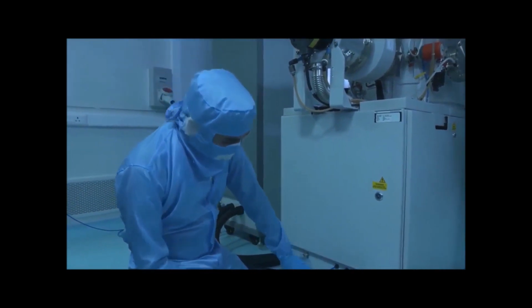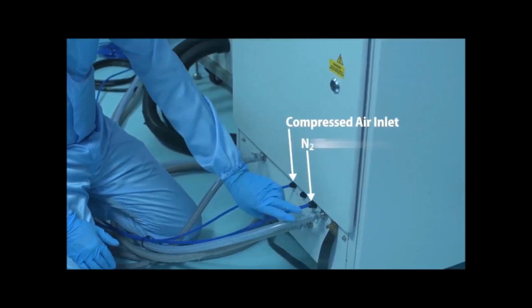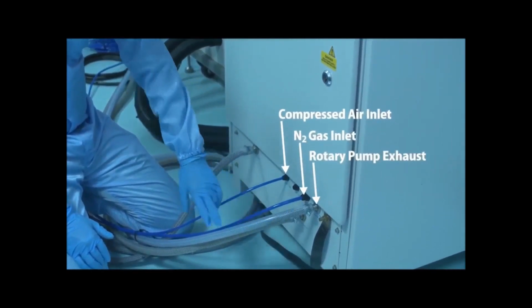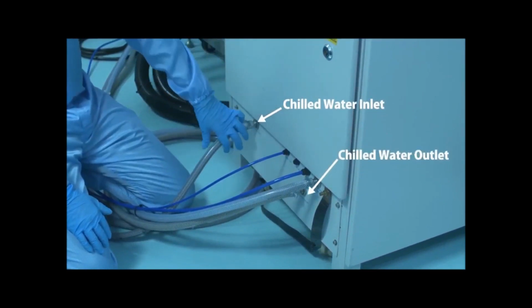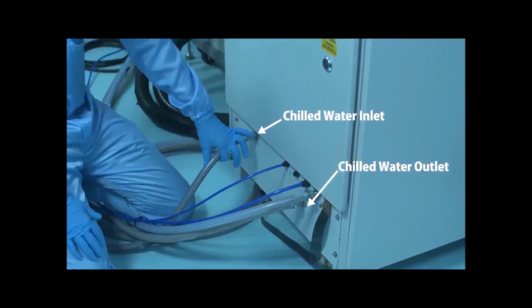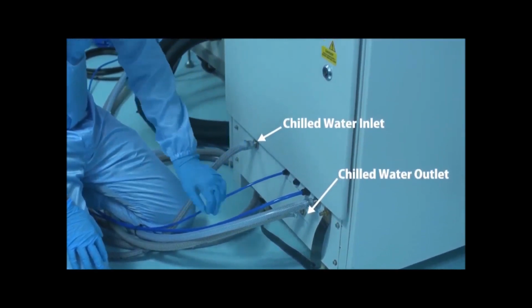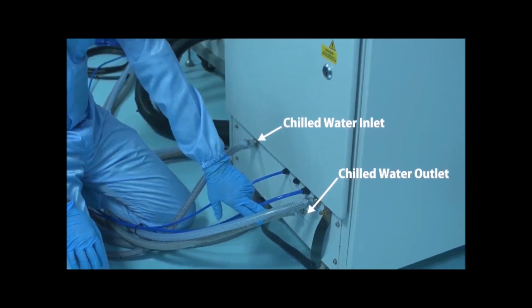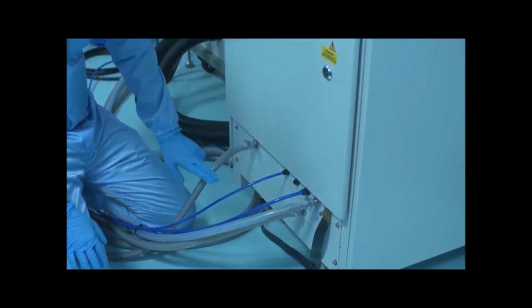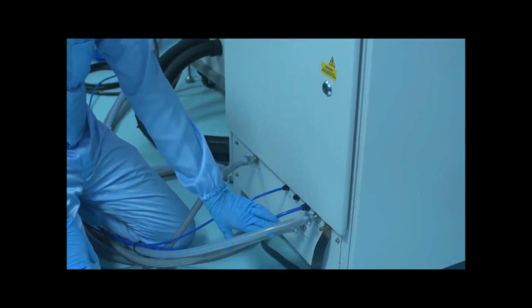So we have a nitrogen inlet, we have a compressed air inlet, we have the rotary exit point here, and all this chamber and the turbomolecular pump have to be cooled down using our chiller water. So this is the chill water inlet, and it is maintained at 20.5 degrees Celsius, and this is the chill water outlet.